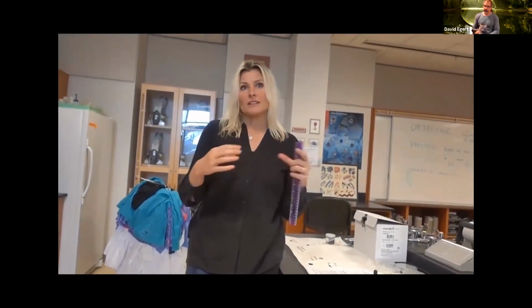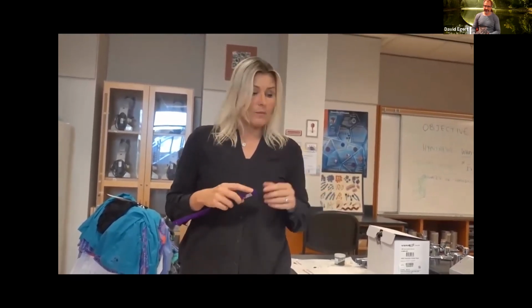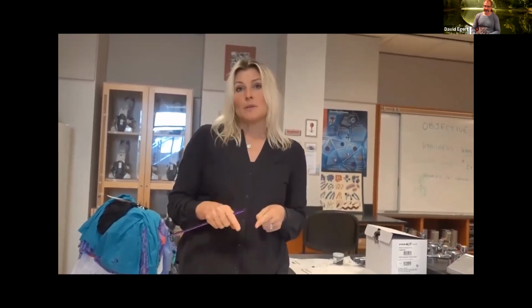But your lab manual is asking you to calculate the rate. When you have a rate, you want to divide the distance by time. So you have a half hour here, but you're going to actually report it as millimeters per hour. Just like if you're driving down the freeway, you're going to be talking about your speed, which is a rate. It's how far you drove over some time. It doesn't matter if you're driving 2 hours or just 20 minutes, you're still going to report the rate as per hour. And so that's what you're going to do here too. Even though you just waited 30 minutes, we're going to report how many millimeters per hour it diffused in the first half hour.